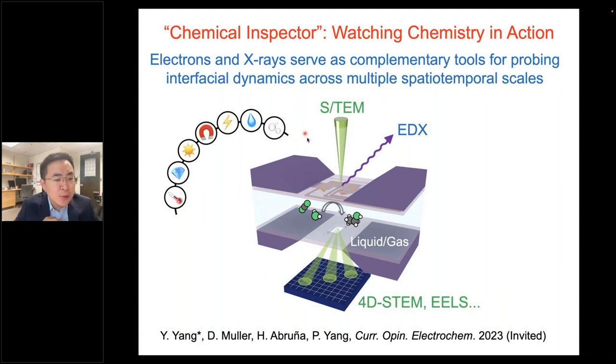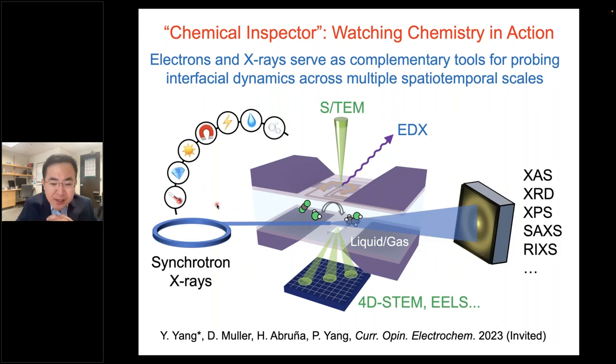So what I'm showing you here is a combination of scanning transmission electron microscopy with a special liquid cell, and then probing the reaction dynamics over here. On the other hand, we can also use synchrotron X-ray to provide complementary information.